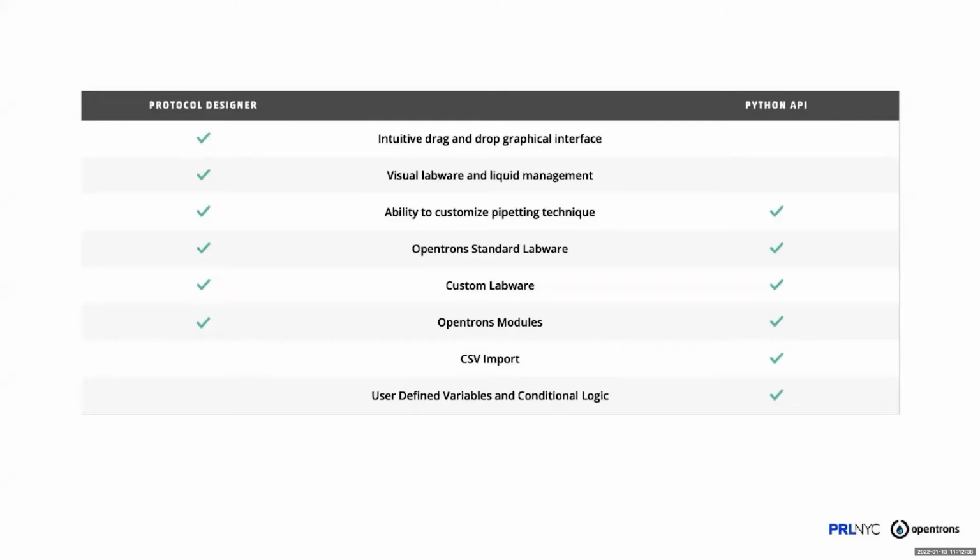So the advantage with OpenTrons is that a lot of these issues are completely mitigated. It is a lot cheaper as a robot. This is primarily because of the way it handles liquid level detection, in that it basically relies on the user to manually calibrate the robot rather than using conductive tips, as you would see for Tecan and Hamilton.